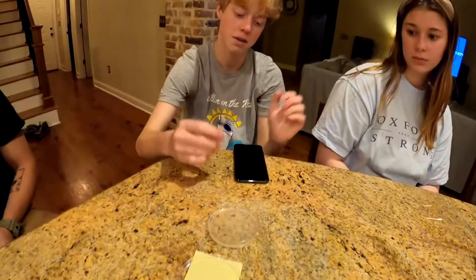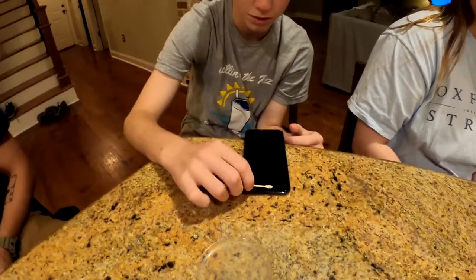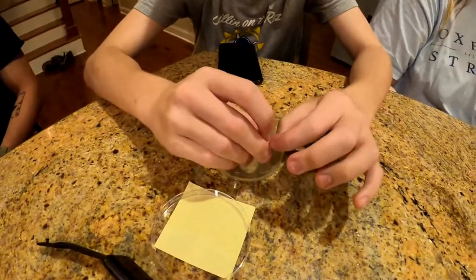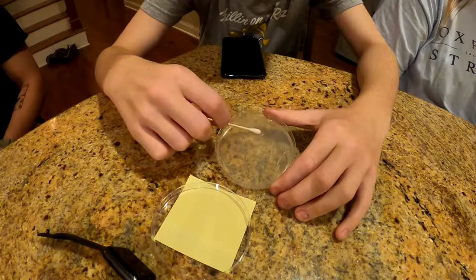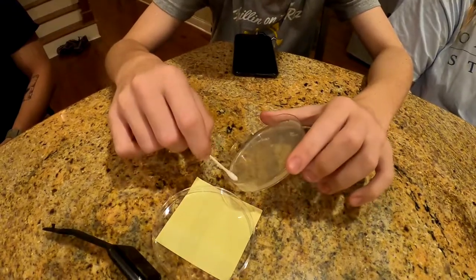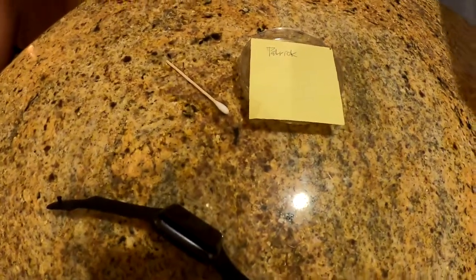The next person swabs the home button and the power button of their phone, then rolls it onto the agar. Notice everybody has a post-it note so we know which sample belongs to which person.